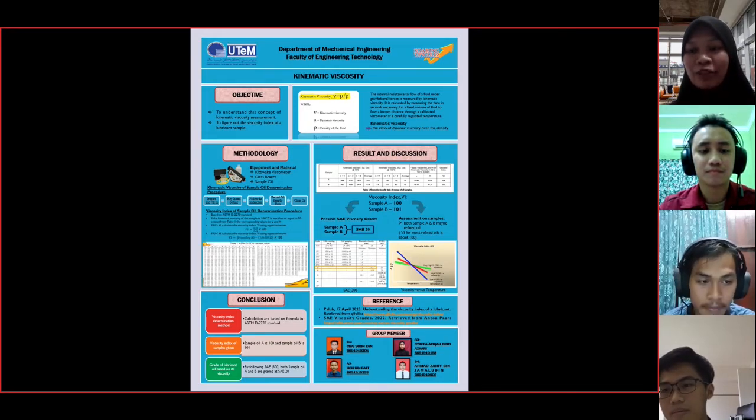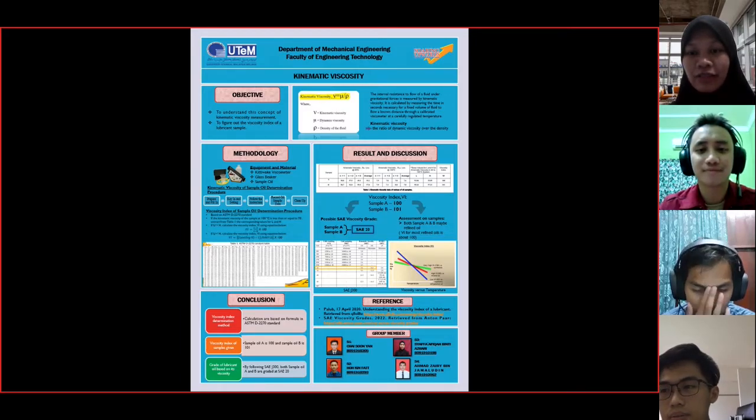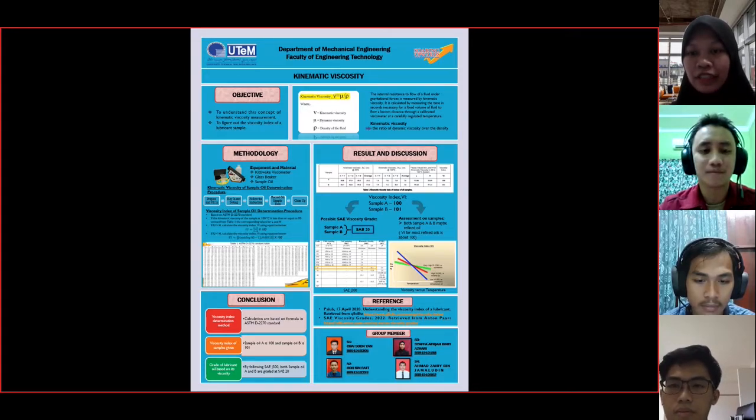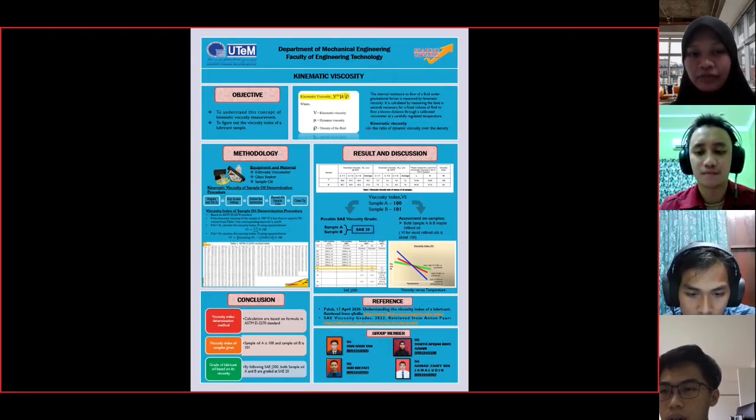I'm going to be speaking to you today about the introduction, which is the internal resistance to flow of a fluid under gravitational force, measured by kinematic viscosity. It is calculated by measuring the time in seconds necessary for a fixed volume of fluid to flow a known distance in a calibrated viscometer at a carefully regulated temperature. Kinematic viscosity is the ratio of dynamic viscosity over the density of the fluid.